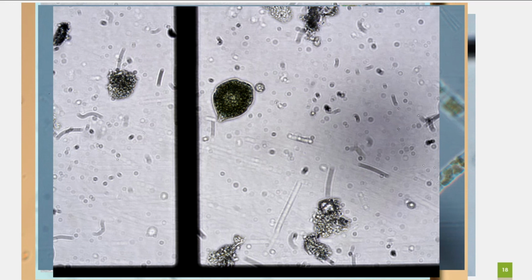And the toxicity. How long does it take for a mouse to die? Like in seconds. Yeah. And they do that. Is that what those bags are? We are doing that, and we're probably moving away from that. I hope so. That test does not tell you anything about the content. Is the mouse dead within so many seconds? Yeah. Then the table says that is 130 mouse units per 100 grams of tissue.